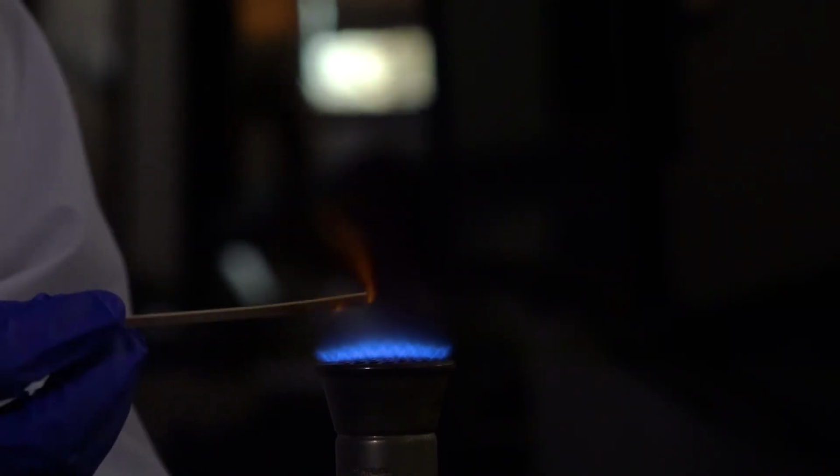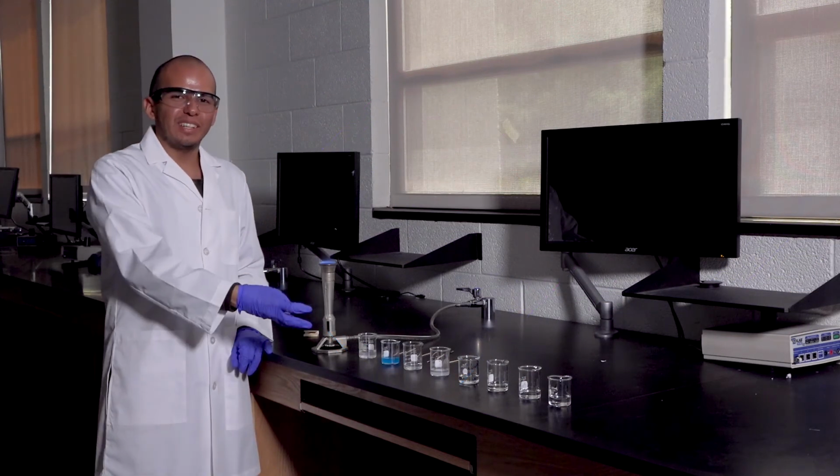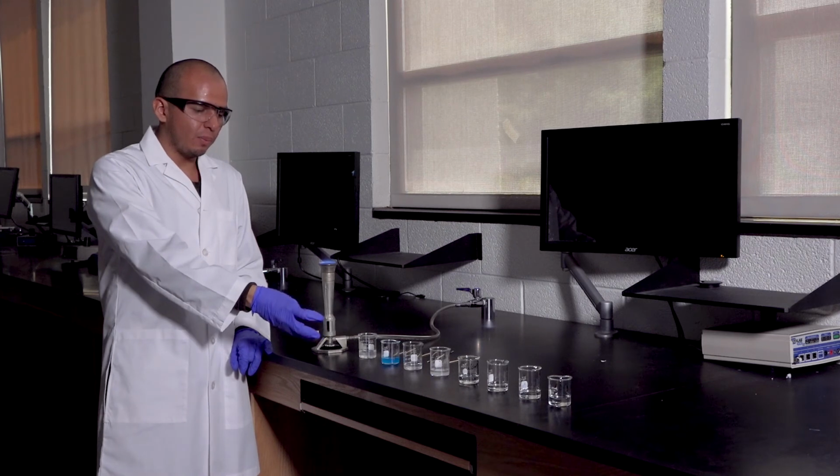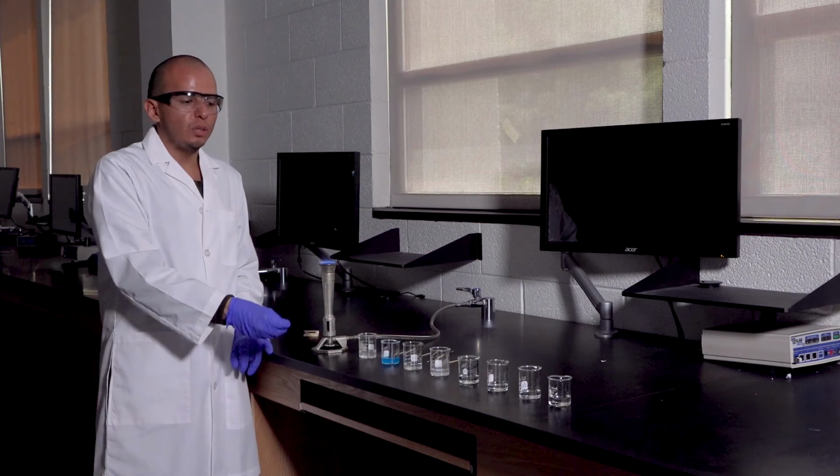Next, we're going to try out borax. Borax has many ions in solution, but we're going to see which is the main one when we light it on fire. You can see it's still orange. So definitely sodium or calcium is in there. Since we saw the four different chemicals that emitted different colors, I'm going to let you try out the rest.